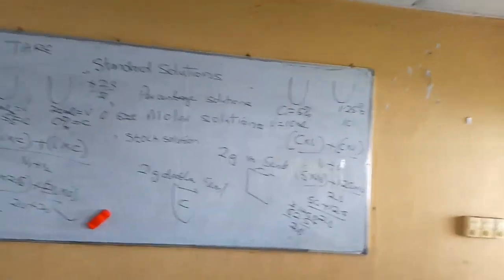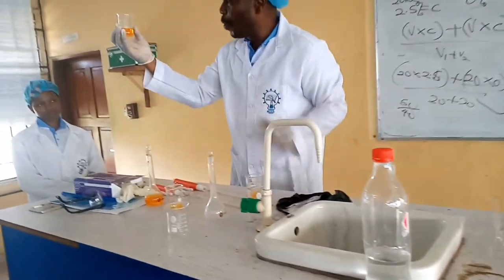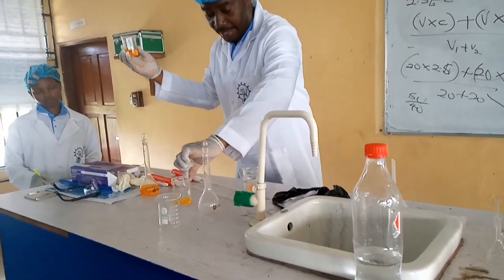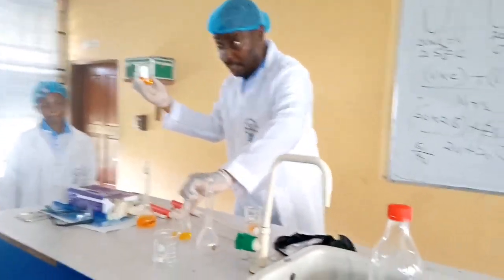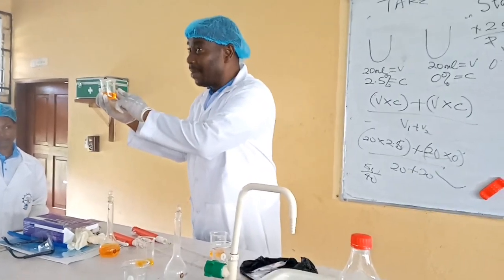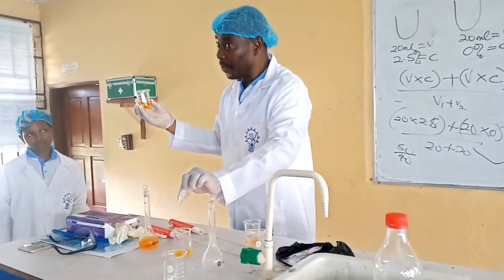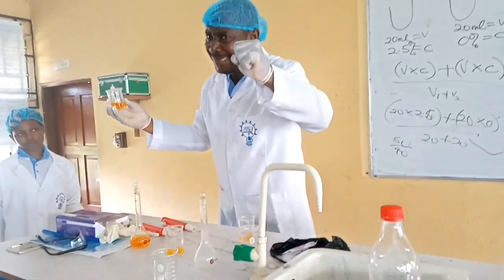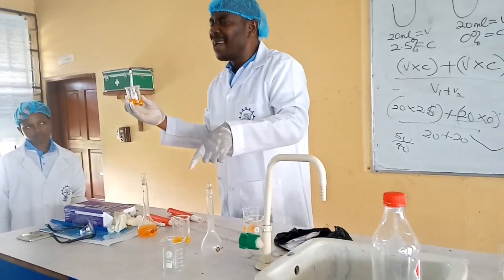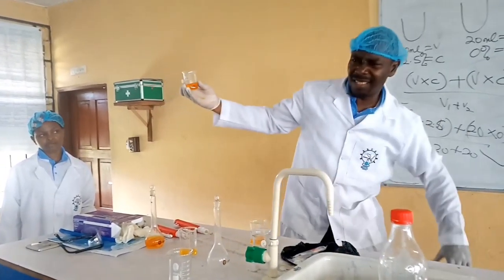Now, let us use our break from the stock. The first time we took 10 mils from here and put into this place, Abi? Yes. Or which one did we put it? This Abi? We put 10 mil and put 10 mil of water. It took it from 5 to 2.5. It now became 20 mil. That equal amount we pour, it turned to 40 mil. 20 mil of water. We come and add it. It's bringing the taste what?